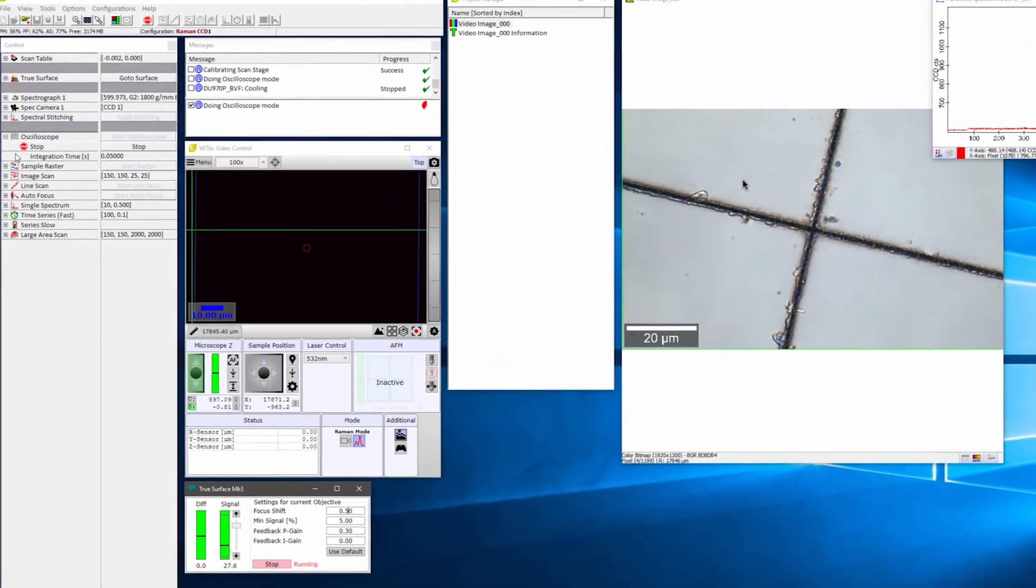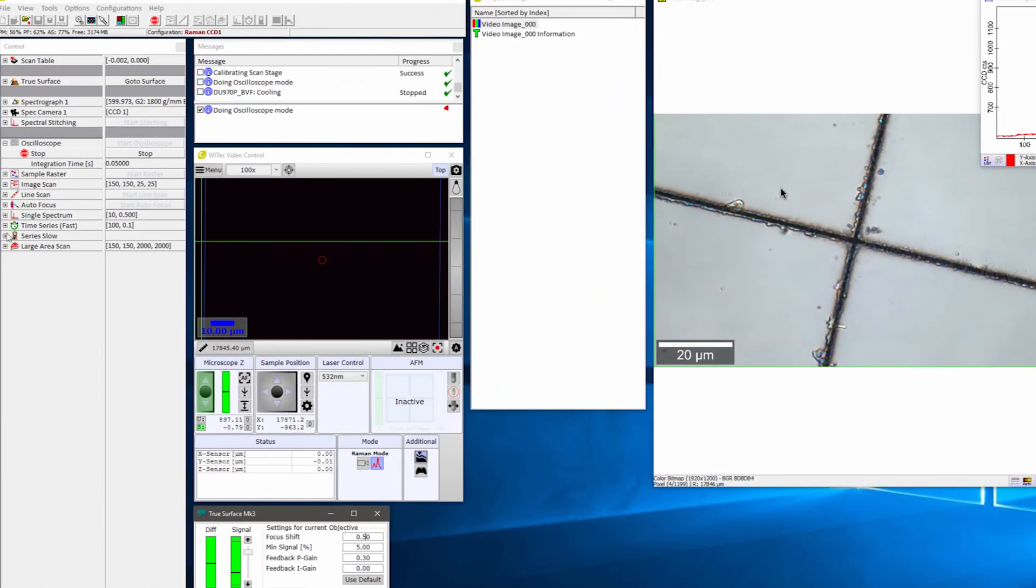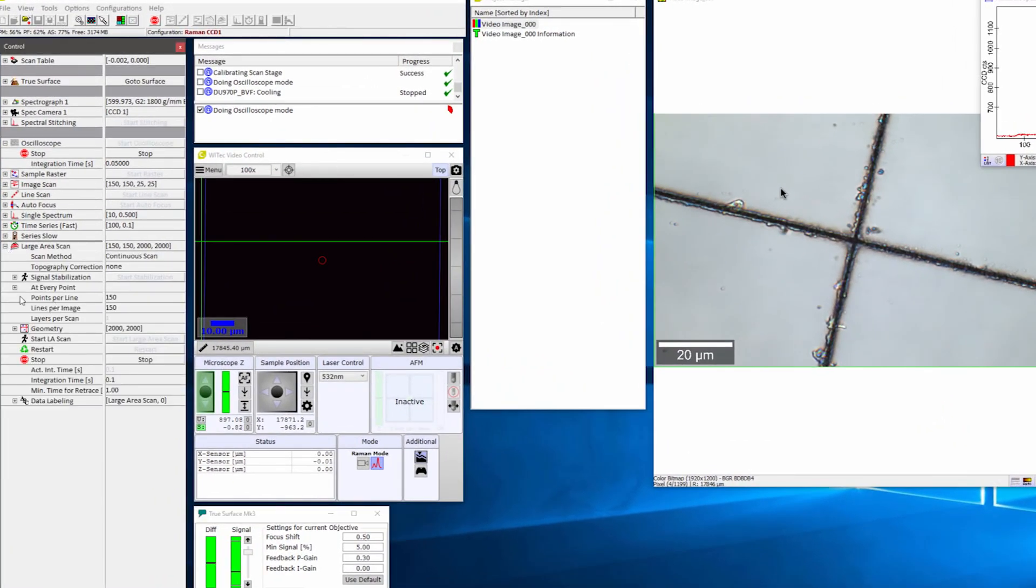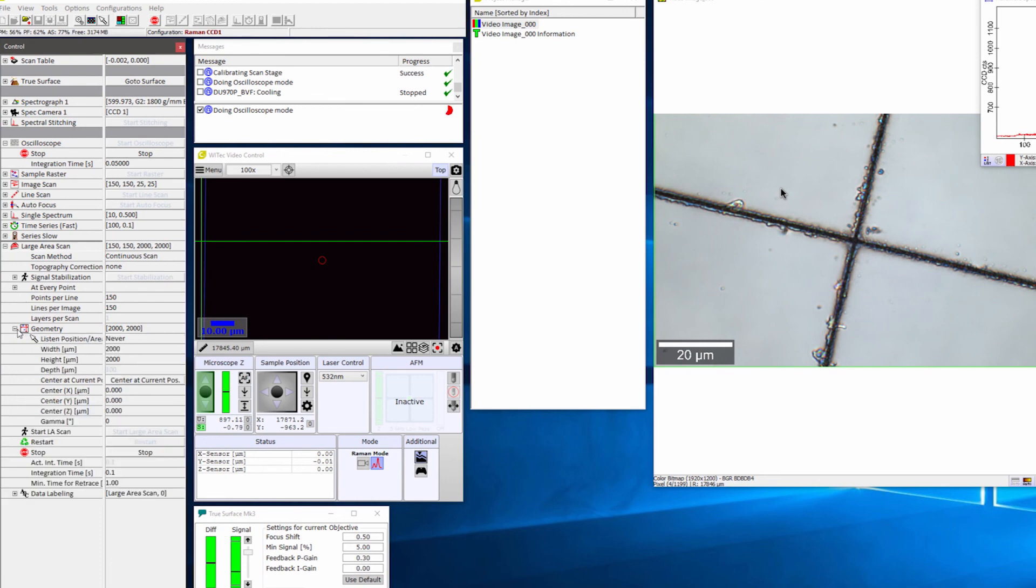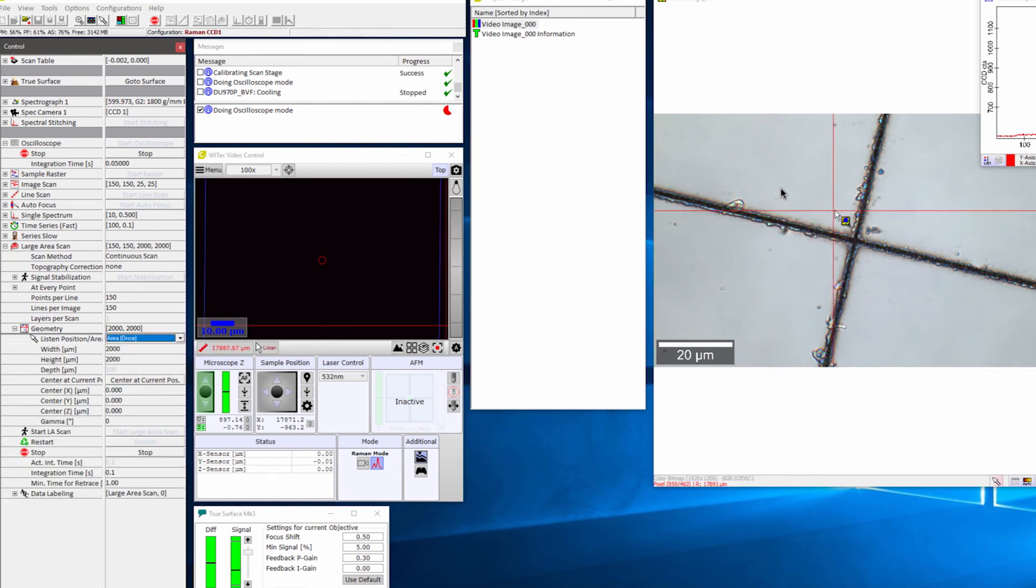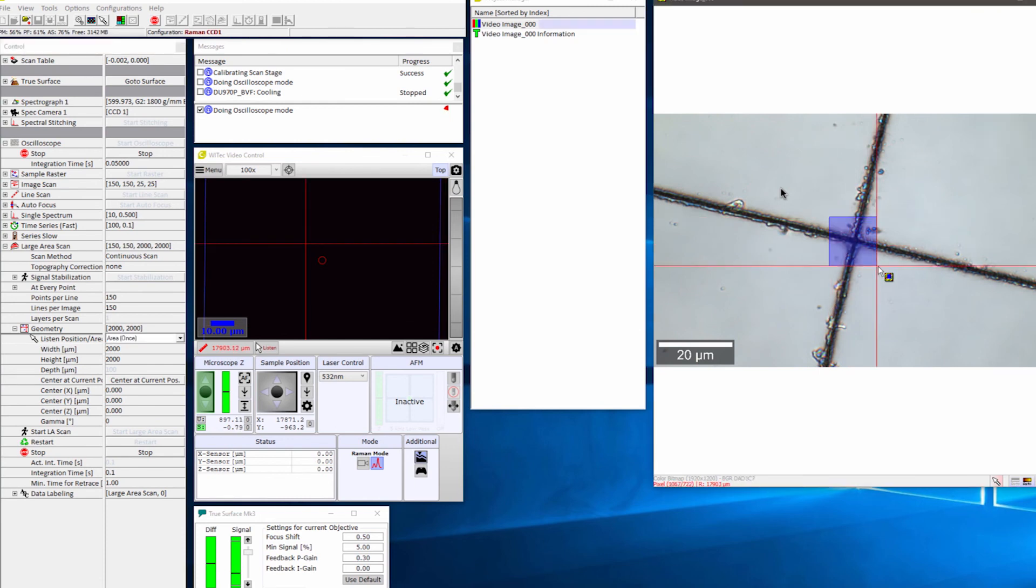In the control window, click to expand the large area scan menu. Click to expand the geometry menu. In the list and position drop-down, select Area Once. In the optical image, draw a box over the area you want to image.